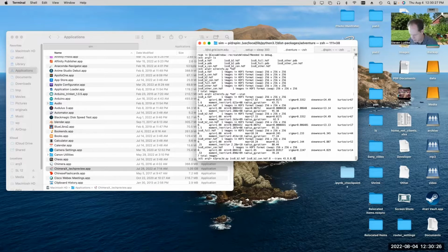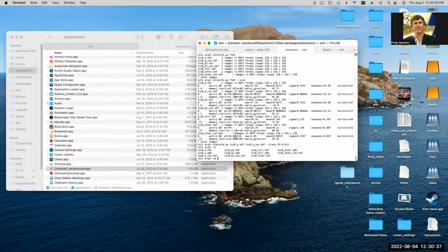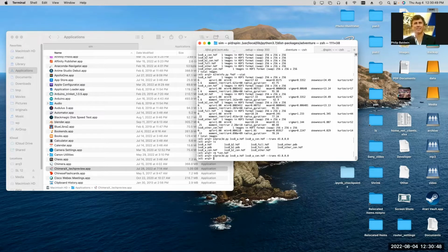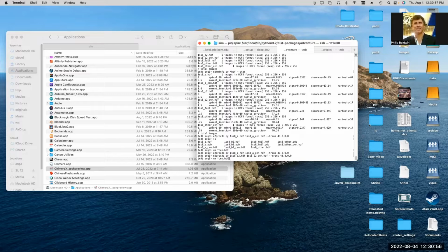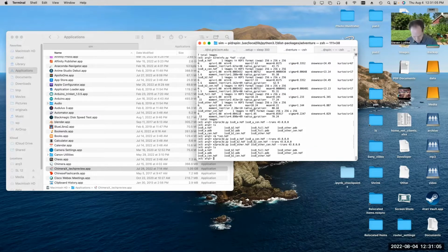All right, I'm going to do it again, but I'm going to just leave the files full-sized. Let me remove the existing files just to make sure we get pristine copies, and we'll get rid of the :8s. I'm going to have to check that later. It should have worked fine. I don't want to recompile while we're doing this, though.